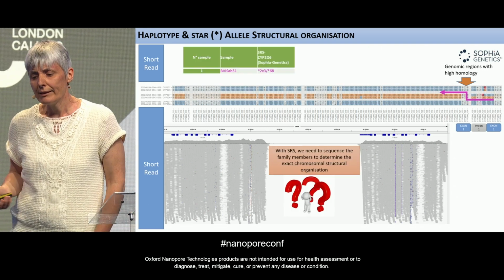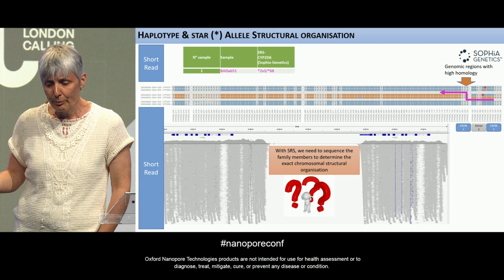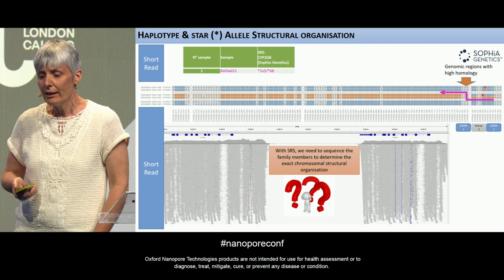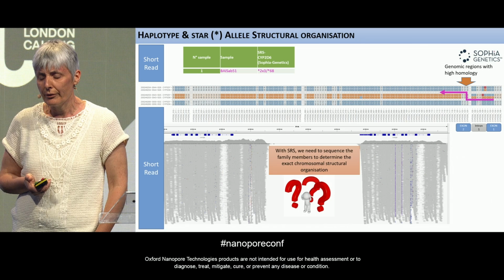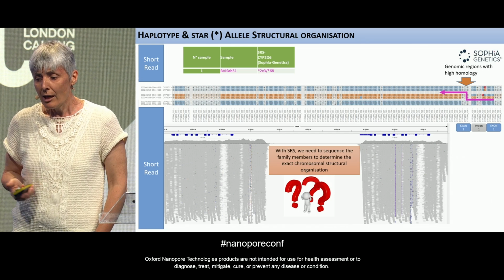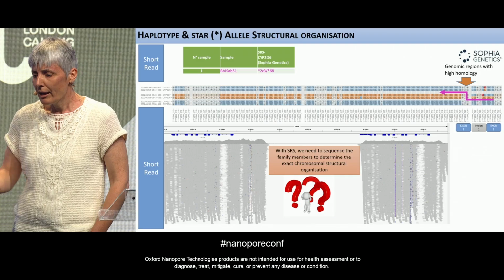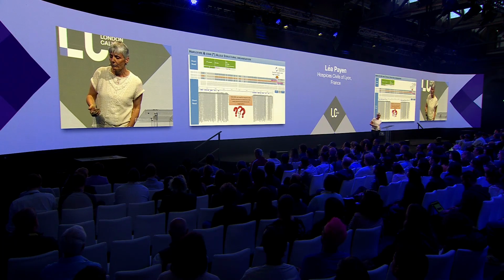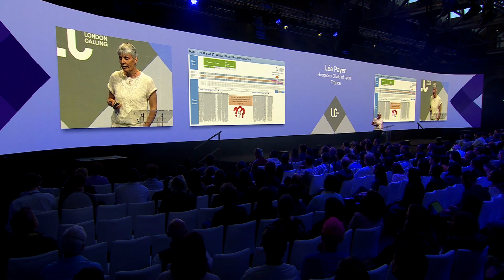But in some cases, we have an additional allele. It's a duplication. As you can see here, the number is 3 instead of 2 at the line of CYP2D6. But it can make hybrids, and it can be combined. And as you can see here, we have a hybrid with the beginning of CYP2D6 and the end of CYP2D7.